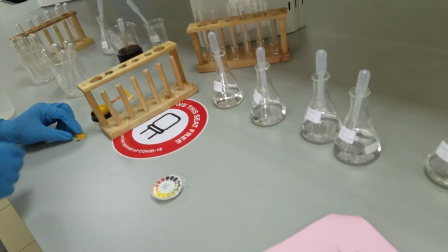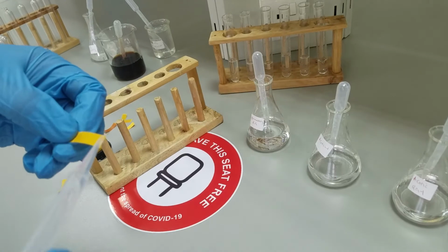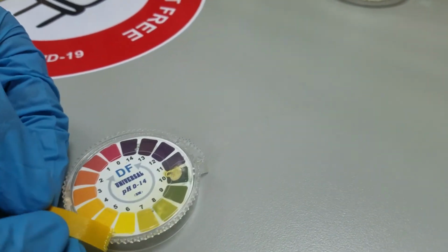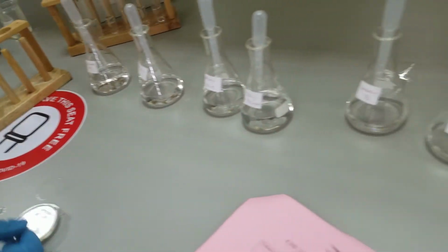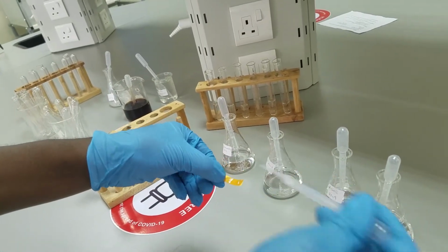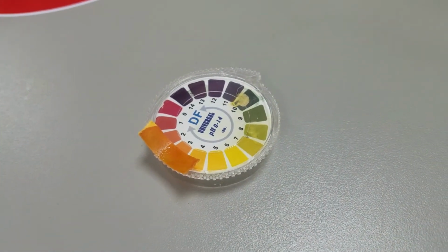Okay. Now I'm going to do my unknowns. The same test, the acidity, pH test. That is unknown B. Look at that, see where it falls, record. And then unknown C. Look at that and see where it falls.